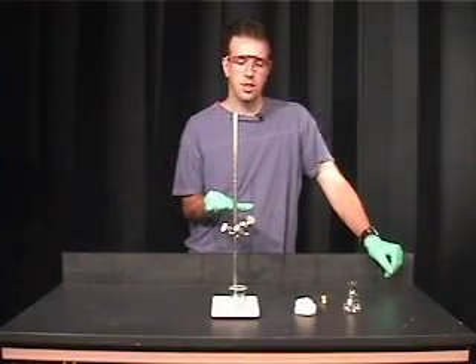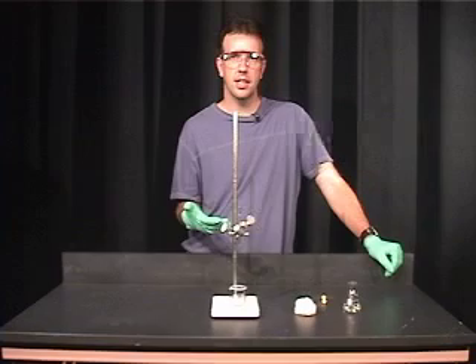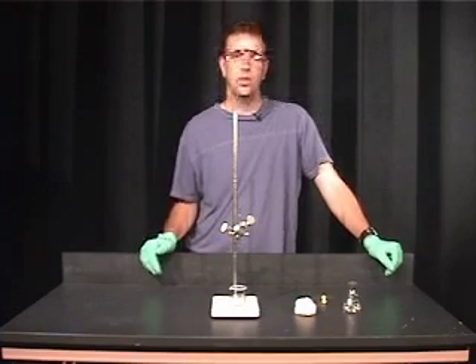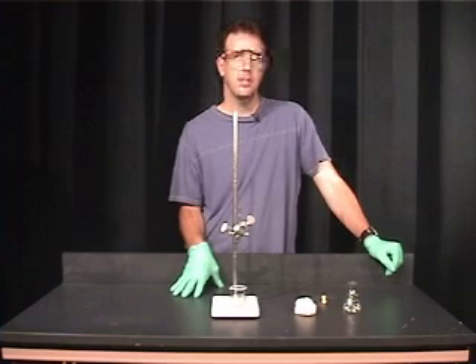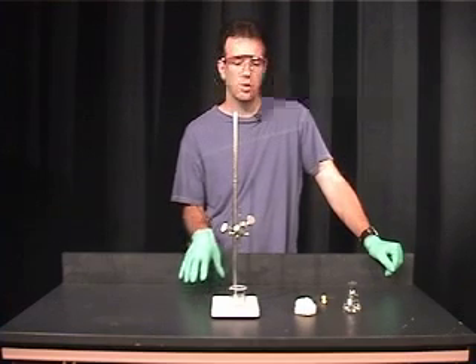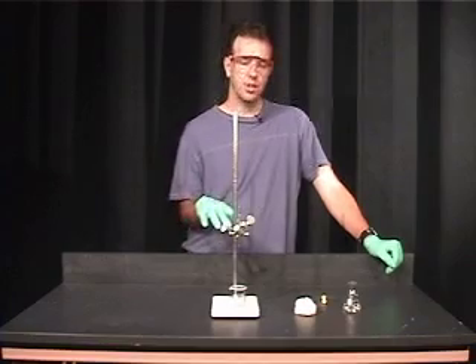This is a technique called creation of a filter pipette. You may need to filter your solution that you've obtained from the extraction of limonene from orange peels before you run the polarimeter. I'm going to show you how to do this.